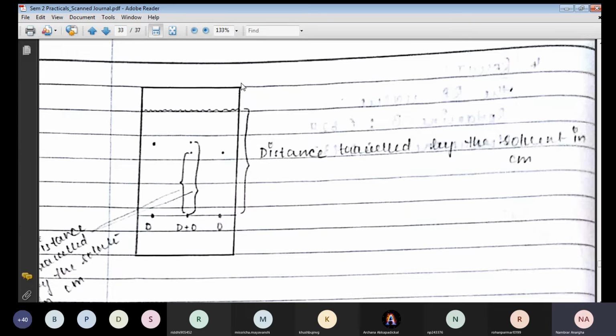Once it is visible, we measure and calculate the distance traveled by both domperidone and omeprazole in the similar manner that we did in the case of dyes. Right? Now, iodine chamber. Why do we use iodine chamber?